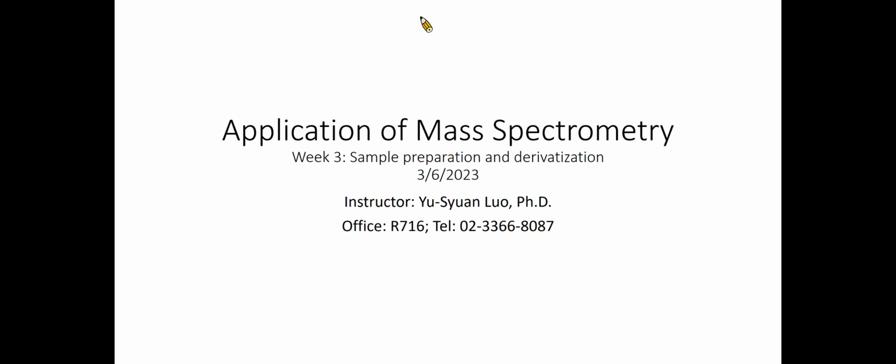Last lecture, we went through the basics of mass spectrometry. Today, I'm going to navigate you through the first step of mass analysis, sample preparation and derivatization.